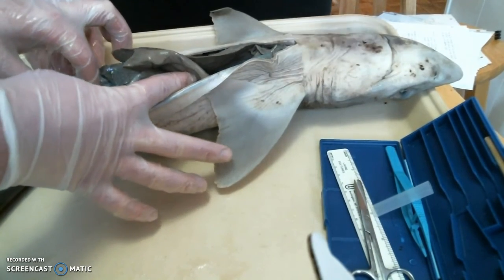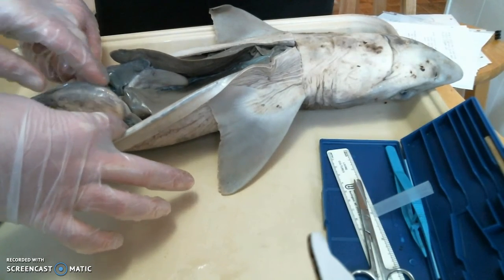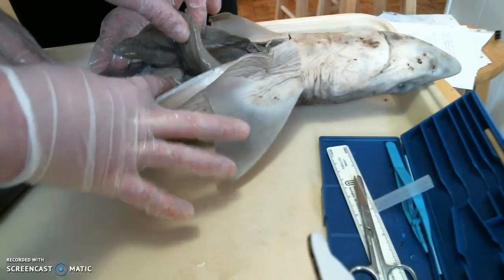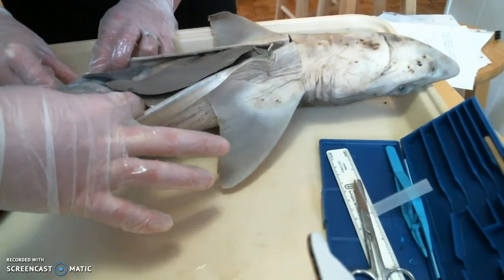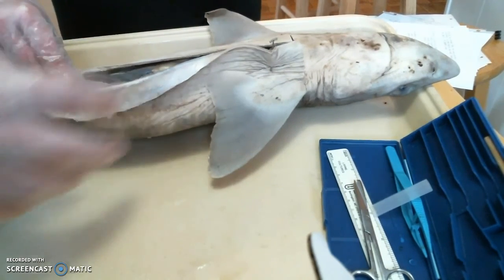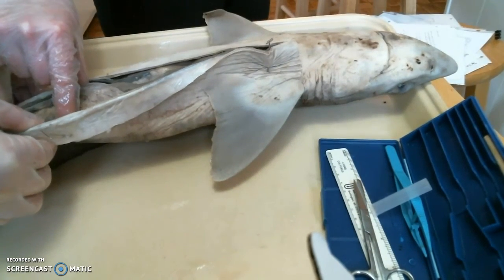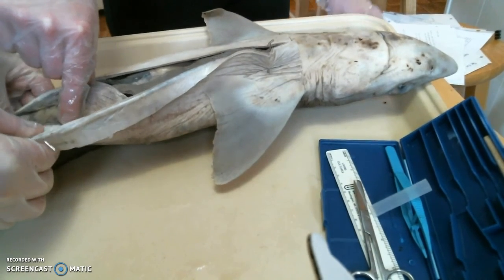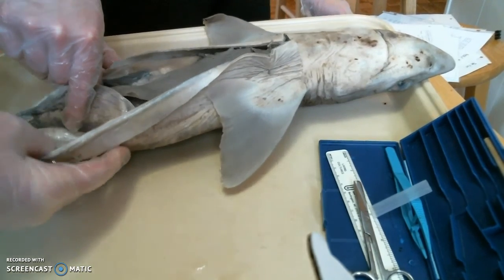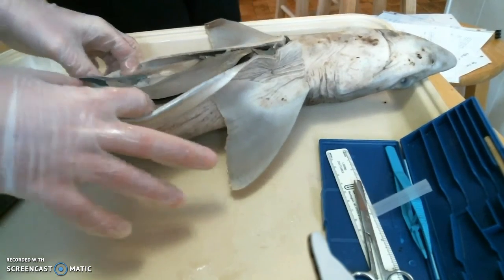One, you just have to keep in mind, this is a pregnant shark. So at some point, we're going to be finding a uterus with... Oh, okay, that's probably... So that's what I'm thinking is this could be the uterus, but so could this. This is pretty soft and this one's more hard, so I'm not sure yet. Basically, we, at some point, have a kidney and a pancreas, but it doesn't really give you descriptions in her notes here of those. I guess I should have brought home the other stuff that she had. Well, is it supposed to have two kidneys? Because it looks like it's got two of these.